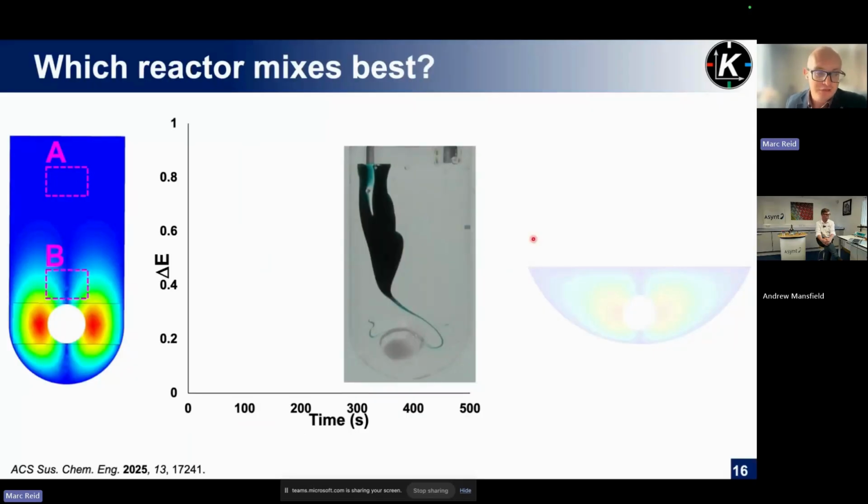A simple lab scale Schlenk tube, first of all. We can once again look at computational fluid dynamics models of these systems and how they're stirred with traditional stirrer bars. And as you can see again here, the power exerted by the stirrer is most concentrated near the stirrer itself, and this dissipates rather quickly, especially in a viscous solvent, as you approach the surface of the vessel.